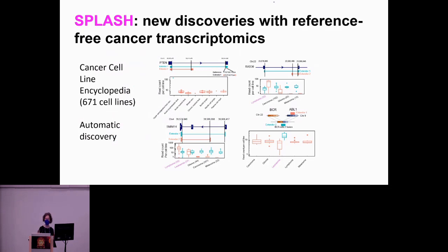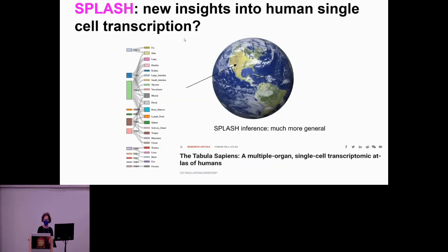Notably, it called a gene fusion BCR-ABL, which is one of the hallmarks of this cell line, and it found novel splicing in known oncogenes, including PTEN, so this cryptic splicing, along with mutations that were embedded in the alignment. That's a clear reason to us why past approaches would not have found this, because spliced alignment or gapped alignment in contexts like this, where the reference genome is actually not accurately representing the real transcriptome, are difficult to call.